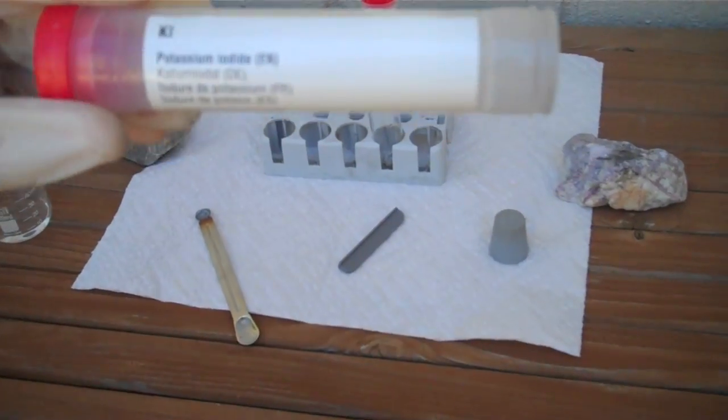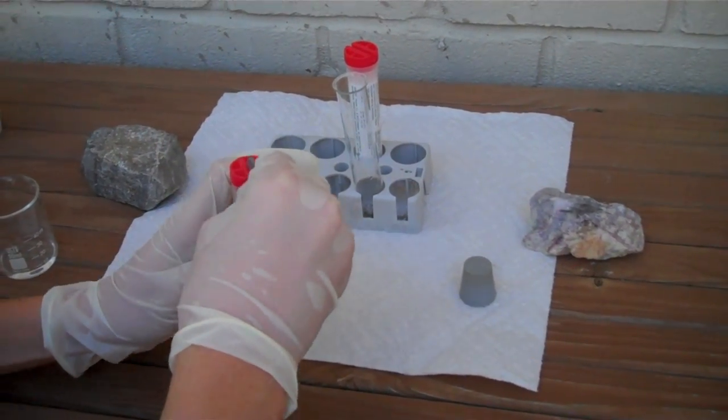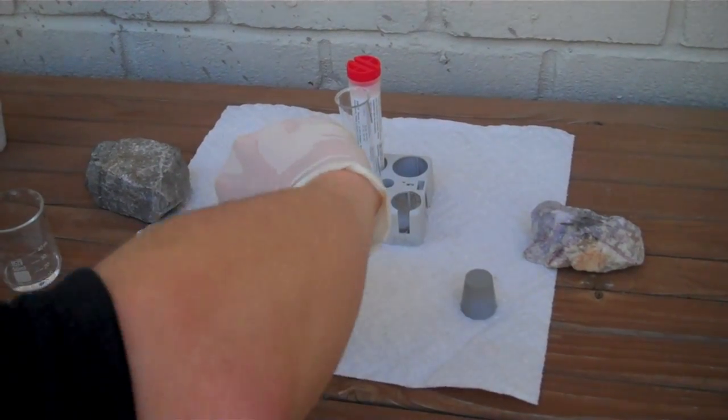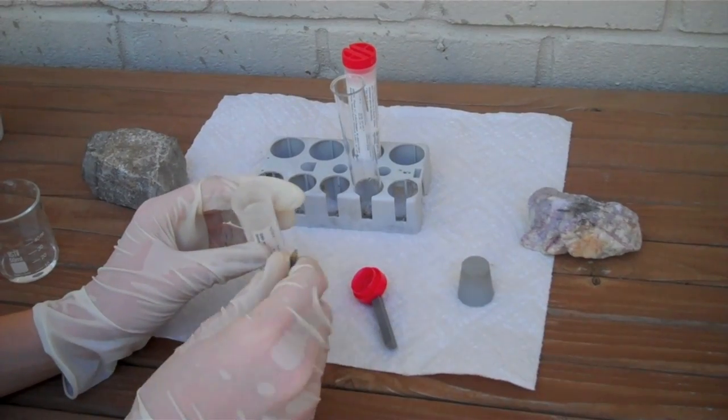First off, get some potassium iodide. Right now I'm opening my container. This is from a chemistry kit. That's why it has these little red container tops on it.